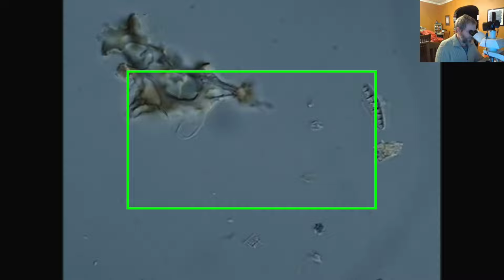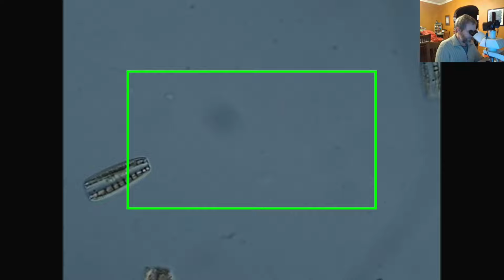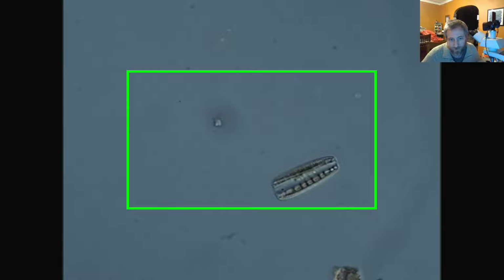I think those are probably Denticula. Even though when I talked to Anna, she said she didn't think that there was Denticula in the sample. I'm pretty sure those are Denticula. I guess they could be the Denticula-like naviculoids.